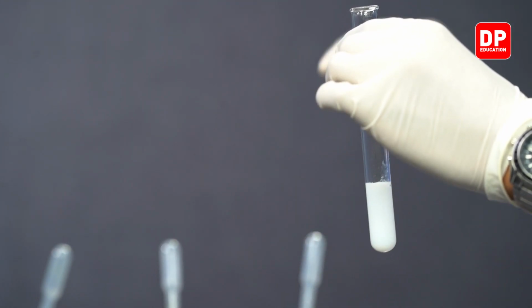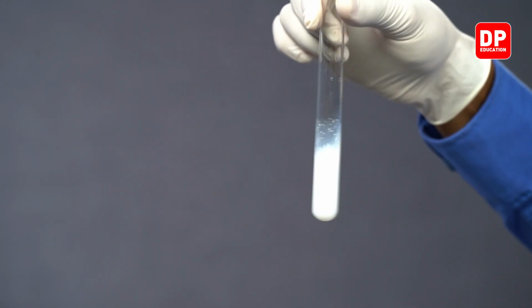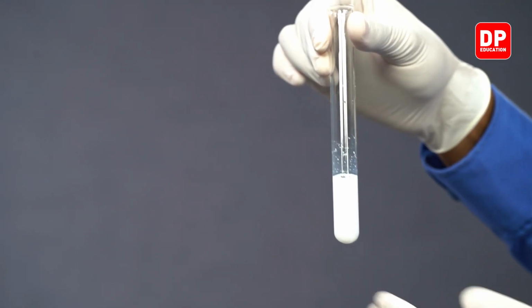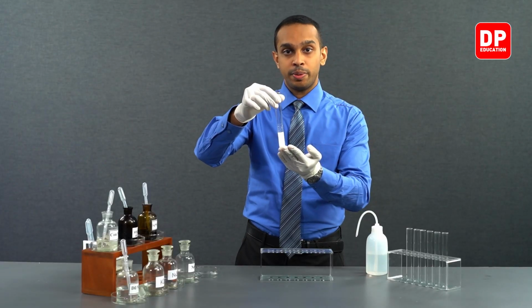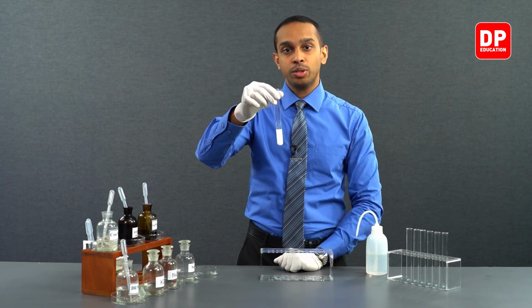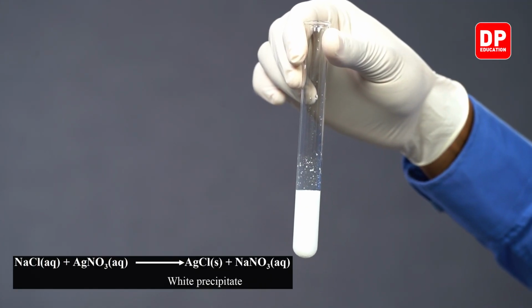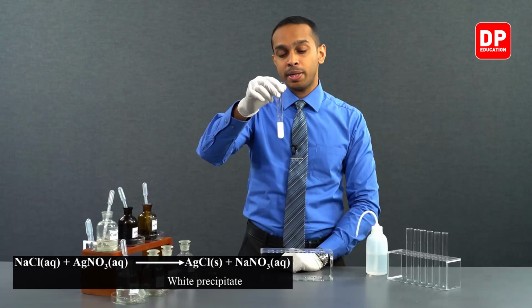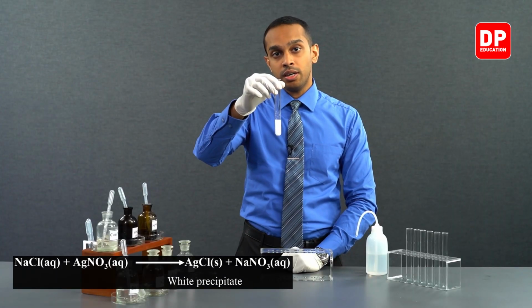As you can see, when you react silver nitrate with sodium chloride, you will be forming a white color precipitate.